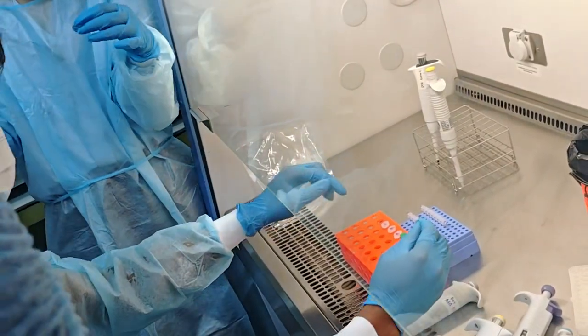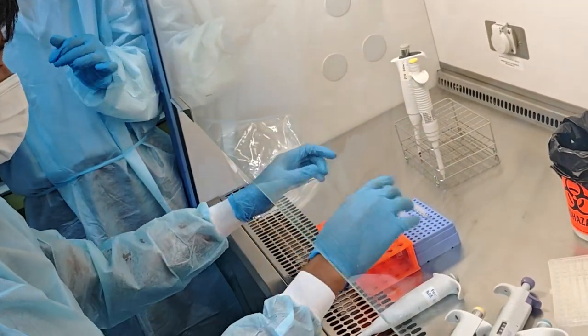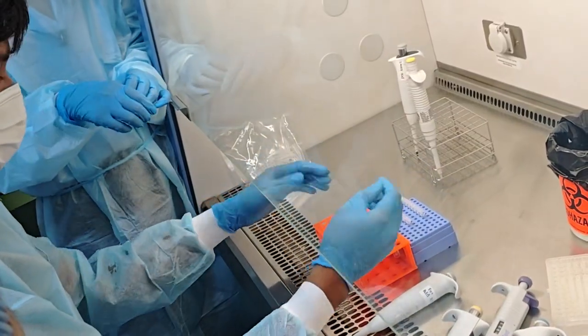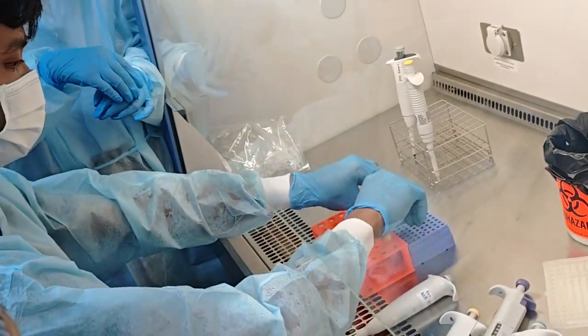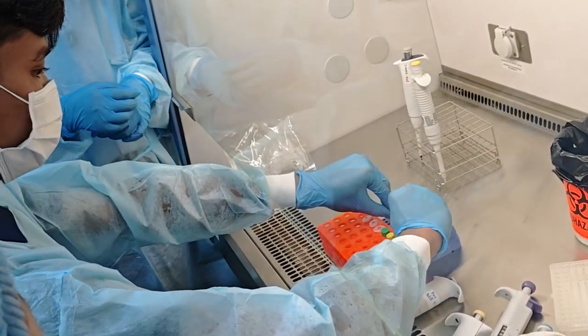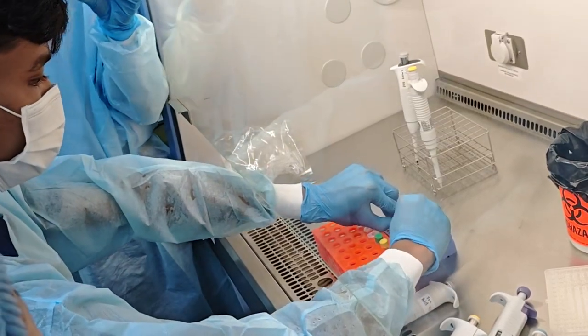According to the side and click. Whatever, okay. Gently, because that's just a centrifuge, so don't shake. When you open up this, you can hold the two sides and click.